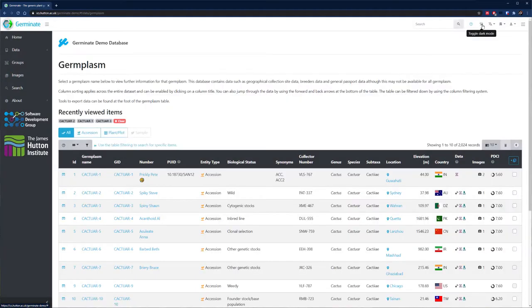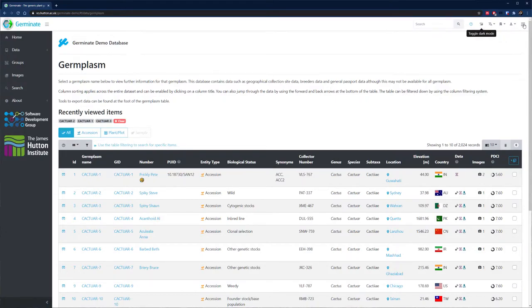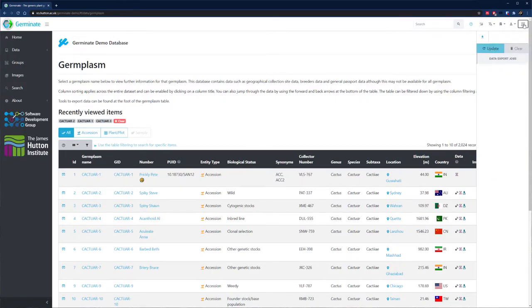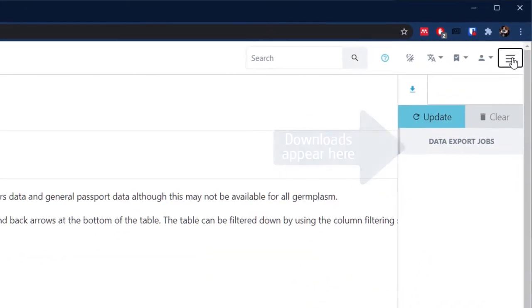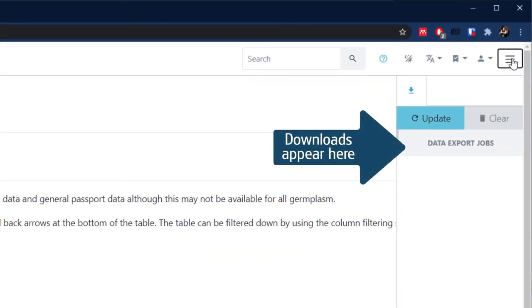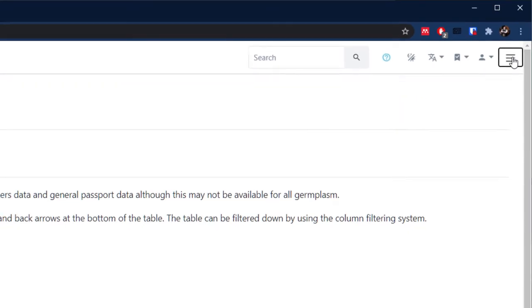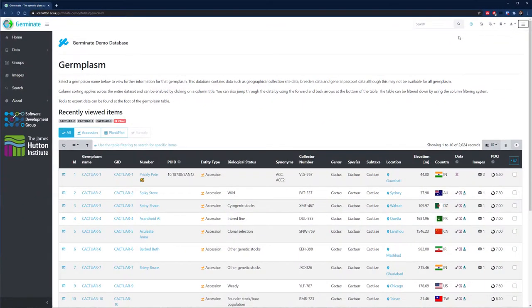Some of the exports that you can do with Germinate may take a couple of minutes to run, and Germinate now supports asynchronous downloads. This means you can request data then go and do something else with Germinate. When the data is ready, the interface will let you know and you can download the data from there. No more hanging about waiting on data.